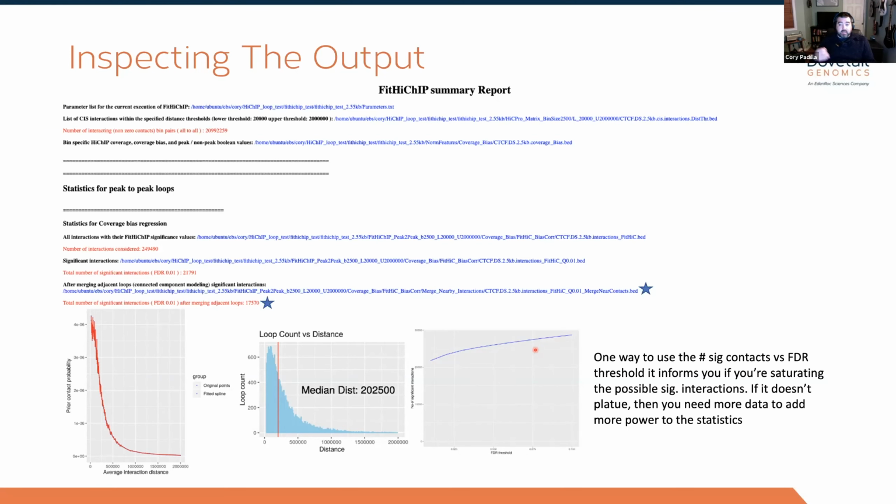And so there's two ways that you could go here. You either need to add more data, right, to be able to saturate those interactions, to be able to put a p-value on them, or you need to loosen your p-value threshold, understanding that you don't have enough data to be as stringent as you would like to be. So that's the two ways that you could play that. And either way is a good option. You just need to state, right, why you picked that route.